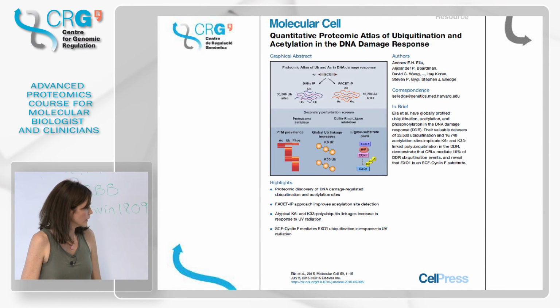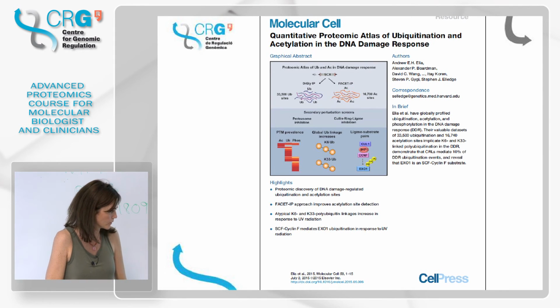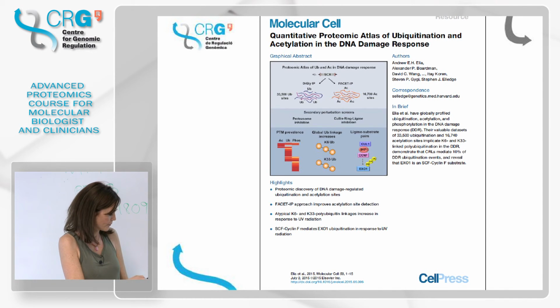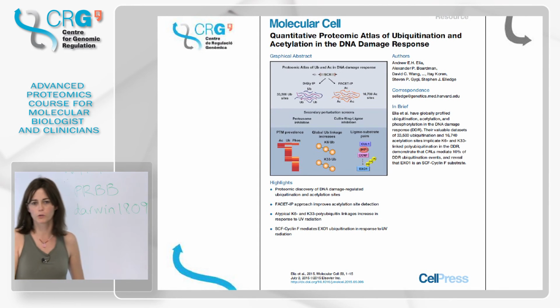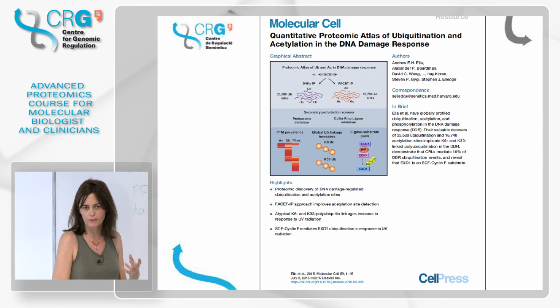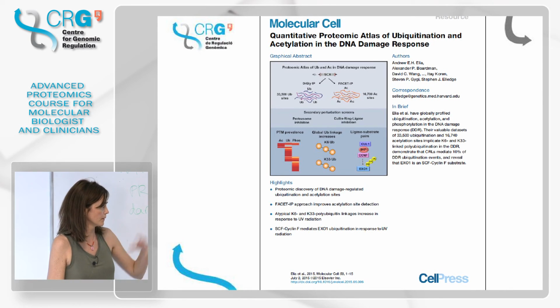Very recently, the date is July 2nd, 2015, so I guess in 2 days it's published, a paper in Molecular Cell from the group of Steve Gygi, that lately this group that we also talked about when we were talking about IMAC and has published lots of things about phosphorylation, is lately working a lot in ubiquitination. So for those of you that are interested, this is a nice paper to read about the whole ubiquitination involved in DNA damage.